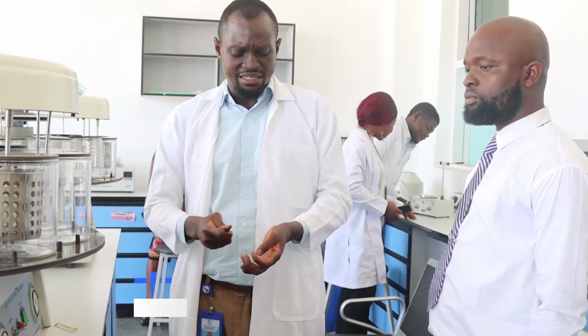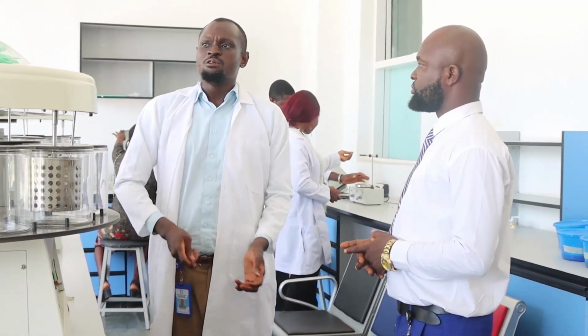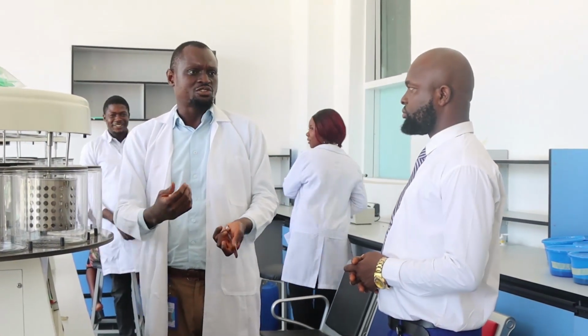Here is histopathology. What do we do in the histopathology department? It is the study of abnormal tissues. When we study abnormal tissues, some tissues that are damaged, in order to detect evidence of malignancy and benign tumors from the tissue where you have injury, we have another place called morbid anatomy. We can call histopathology morbid anatomy. We have a mortuary where we normally get some tissues. We carry out autopsy tests and biopsy tests here in histopathology.